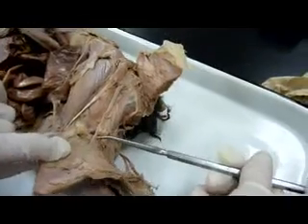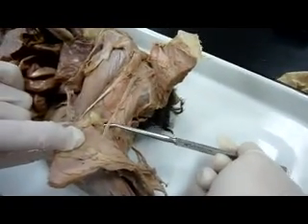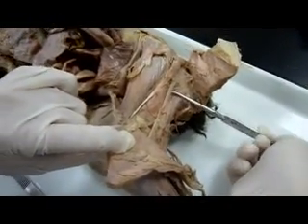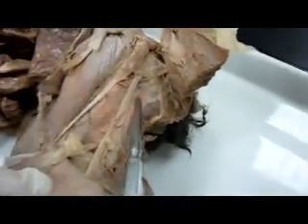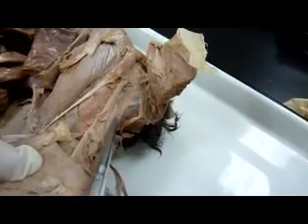The tenuisimus is the one back here — tenuisimus right there. This here is our semitendinosus.